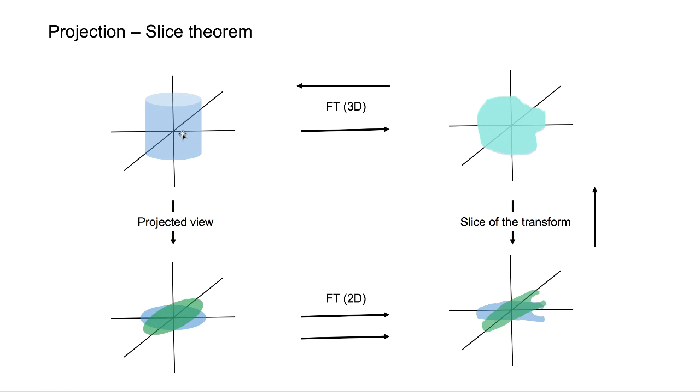So you cannot get the information directly in real space, but you can combine the Fourier transforms of 2D images generated from projected views of this real structure to make a 3D object in reciprocal space, and then you can send it back to real space to get a virtual 3D object, from which you can get a section view of it.